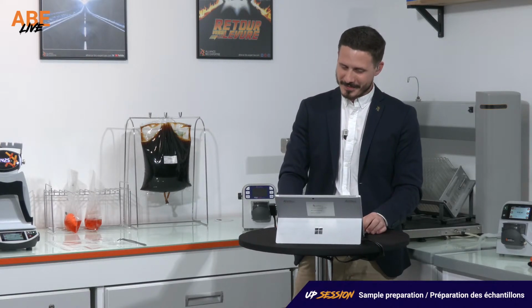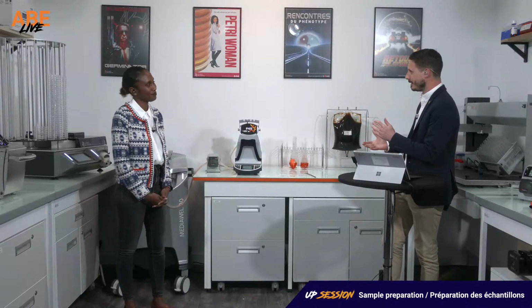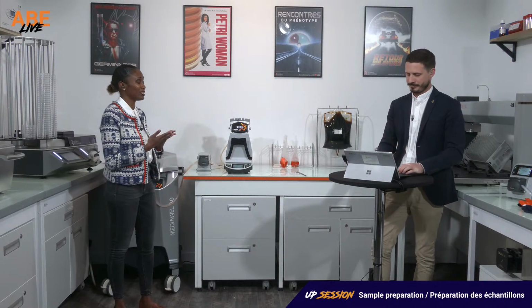So let's go back, Ines. If we go back to the sample you diluted at the start, what will happen to it now? Okay, so I can show you what happened with the step of homogenization. So we said earlier that it's very important to make sure that we have reliable results, that our sample is well homogenized with a blender, for example.